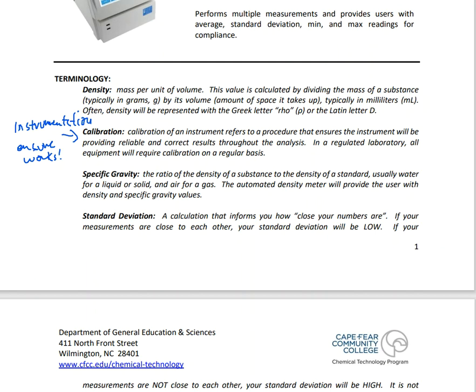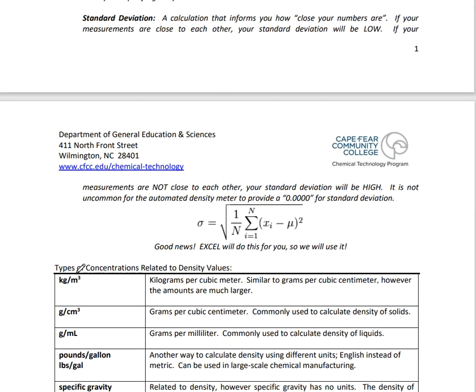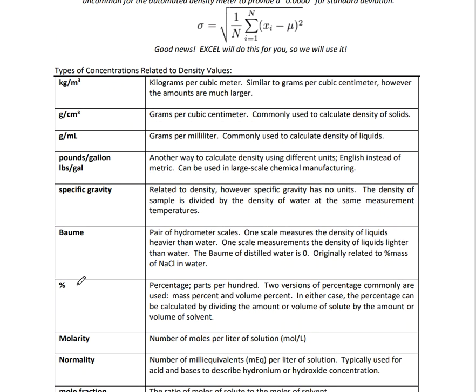So all of our equipment in the instrumentation room has to be calibrated. Even our analytical balances that you've used so far, they have to be calibrated. That was the purpose of the calibration weights. This is kind of the process that we go through in order to do this. So we have to ensure that our instruments are providing data that is scientifically solid, which means we have to make sure the instrument is working the proper way. And this we have to do before we do any kind of measurement at all, period, using that piece of equipment. All right, so this is the idea of calibration, and you will be doing calibration in this particular lab.